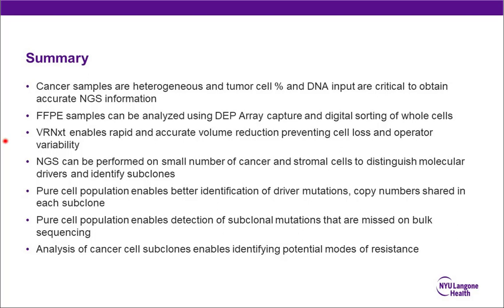Brain tumors are particularly tricky because brain doesn't have collagen and you need to do some adjustments in terms of enzymatic digestion. One thing that we are now currently working on is bone marrows. Our experience with bone marrows is extremely limited, so I cannot really talk about it in detail, but when it comes to solid tumors, I would say yes, pretty much everything.